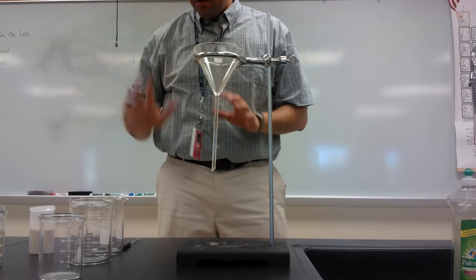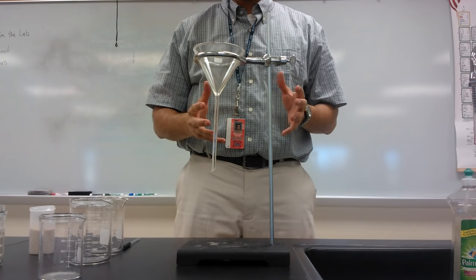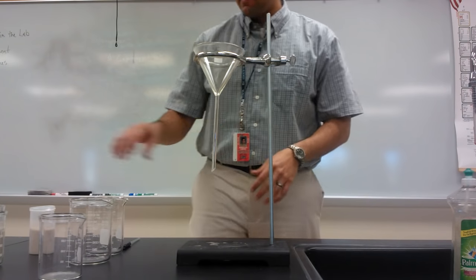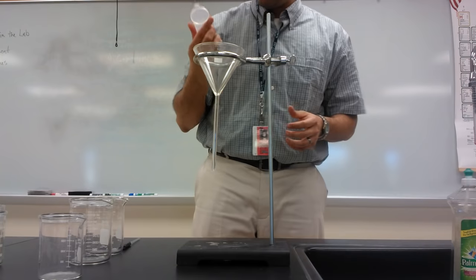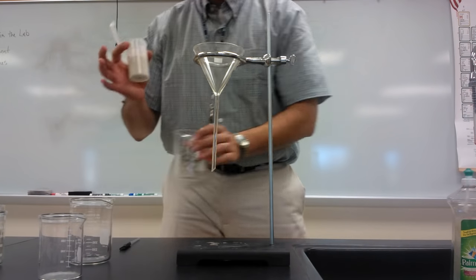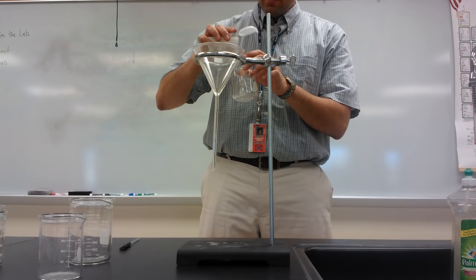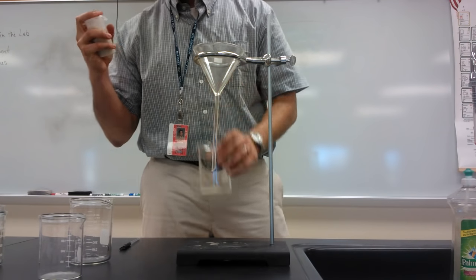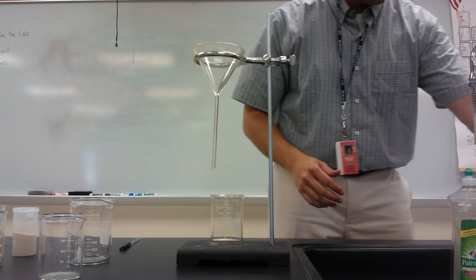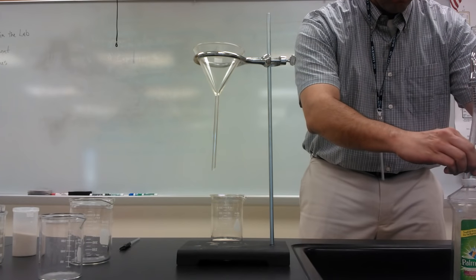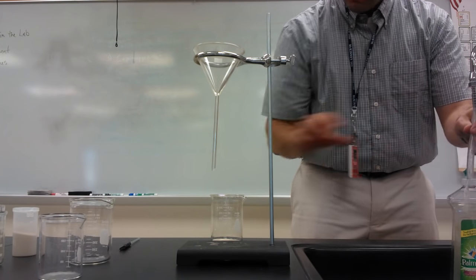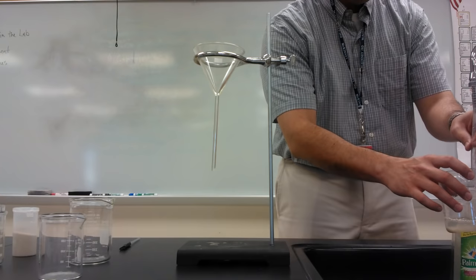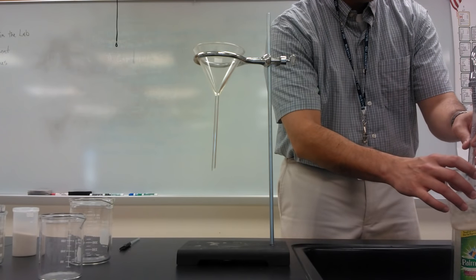Alright, so now what I'm going to do is I'm going to show you two ways of separating a mixture of water and a solid that does not dissolve in the water. So what I've got here is some sand, and I'm going to place this sand in this beaker, placing some sand in the beaker, and now I am going to add some water into the beaker. My goal is going to be to separate the sand from the water and to try to recover the water without any sand particles in there.